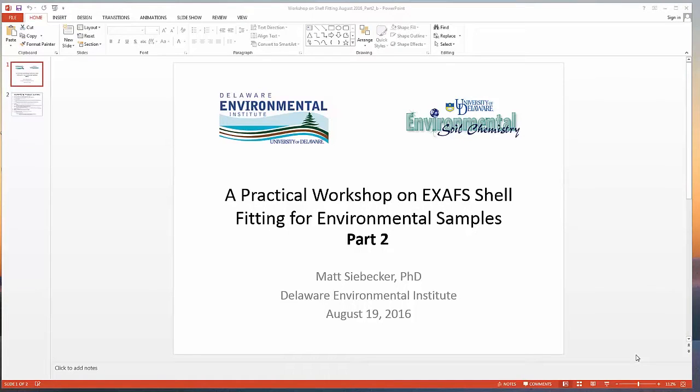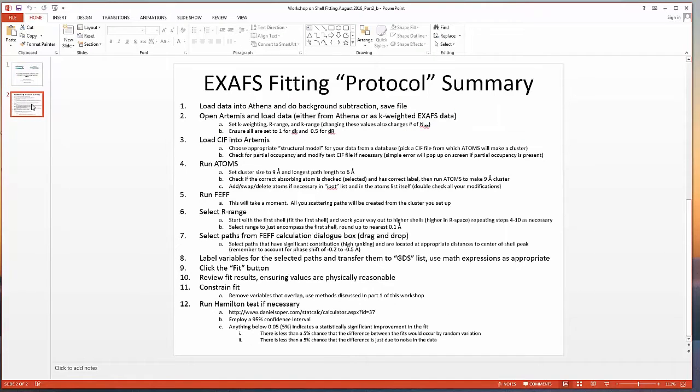Welcome to part 2 of our workshop on EXAFS shell fitting for environmental samples. This video accompanies part 1, and the goal of this video is to illustrate how to use Artemis for shell fitting of EXAFS data. And what I'm going to outline here, in more detail than that presented in part 1, is a type of protocol you can use to get you set up and running your fits.